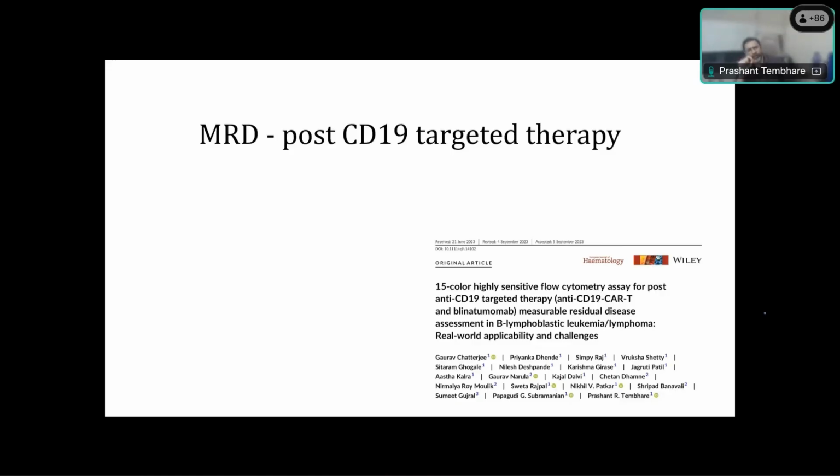In stage 2 hematogones, the level of CD73 expression is very weak, usually weak to negative. So when you are looking at the combination to identify whether CD73 is abnormally expressed or asynchronous expression is there, you have to combine CD34 with CD73, to see if the CD34 positive cells are positive for CD73. If CD34 positive events are positive for CD73, that is abnormal, asynchronous, because normally CD34 positive cells do not express CD73.